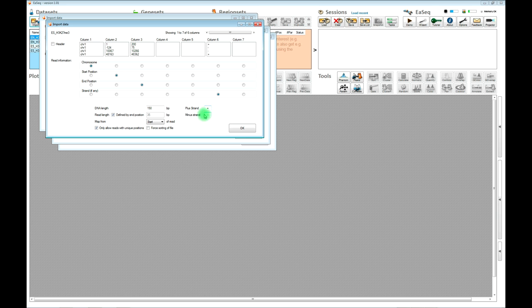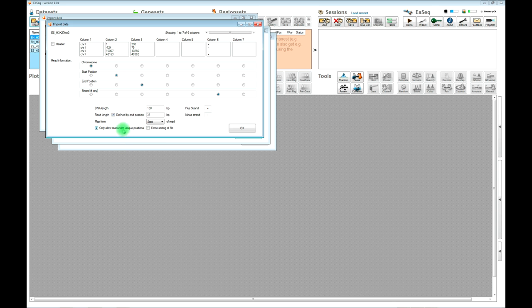There is also some information about how the strand information is coded — now they are called plus and minus, but they could be called something different, so you should change that accordingly if needed. I suggest you don't change the remaining settings as a new user. One good thing to know is that EASEQ by default will filter for unique reads to avoid PCR artifacts. If you are working with small genomes such as yeast or bacterial genomes, you might benefit from disabling this. But for people working with mammalian genomes, I suggest you use this by default.